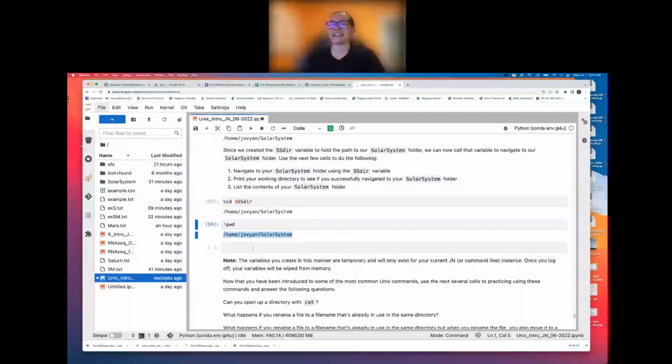Yeah, someone got an error and realized that it was a capitalization error. So anytime you guys run into an error, the first thing you want to check is syntax. You want to check to make sure that all your caps are right, all your lower cases are right, and you didn't accidentally put a space in there.